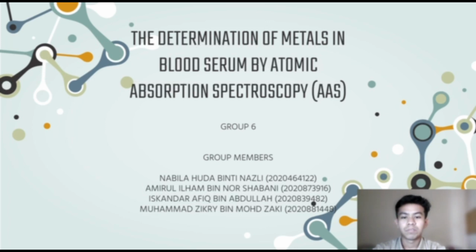And the topic for our group is about the determination of metals in blood serum by atomic absorption spectroscopy (AAS). In this video, I will present my part. I have two parts, which are the introduction and also the objective.